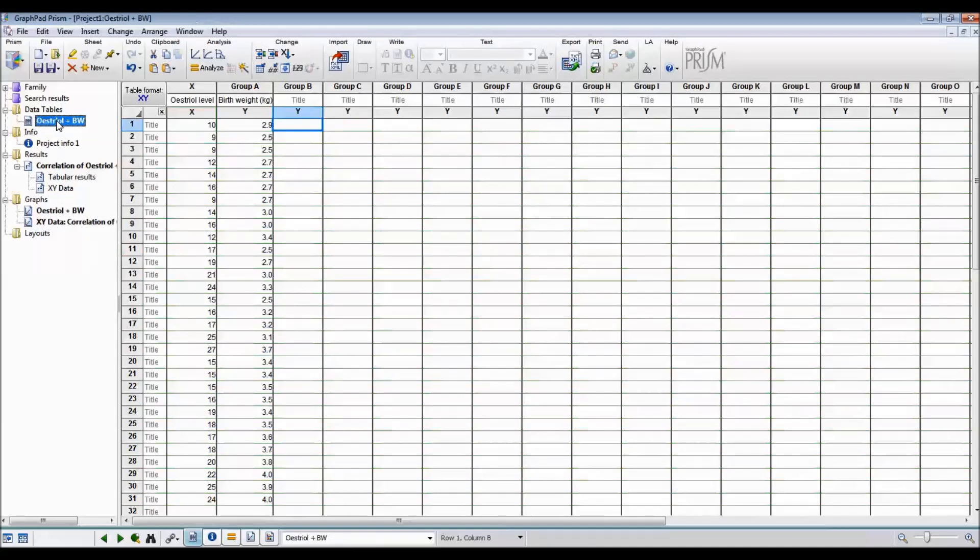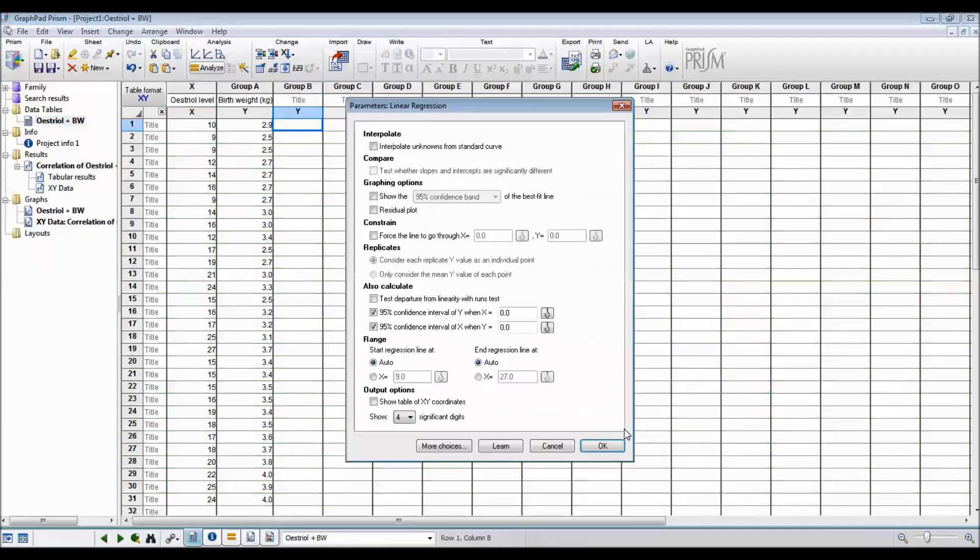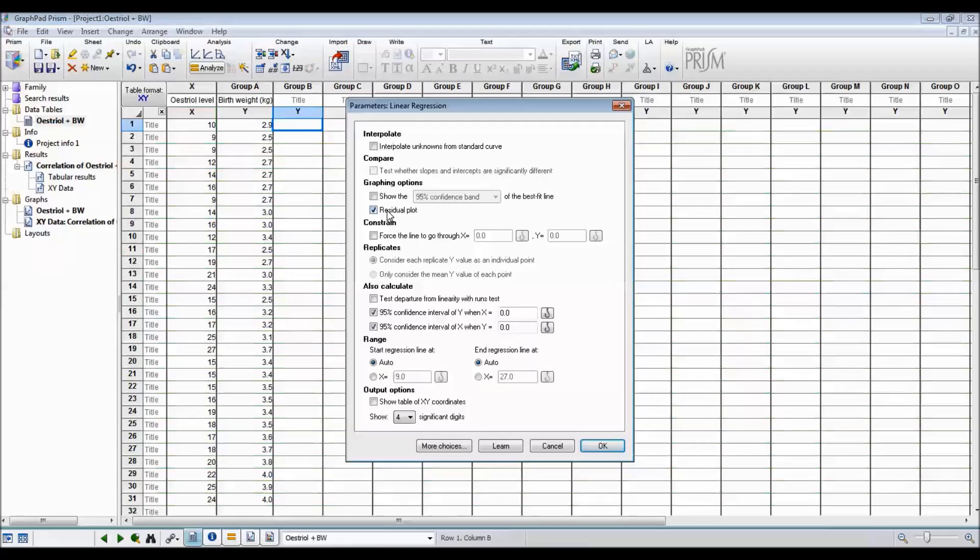Now, I want to do linear regression. So I go back to the original data table and I hit Analyze. And then I go to linear regression. There are lots of options on this particular pop-up window. After we've done the analysis, we want to look at the residual plot to see how good the line of best fit is. So we tick that. We want the 95% confidence intervals to be calculated. And we want the regression line to start and stop automatically. So now I say OK.